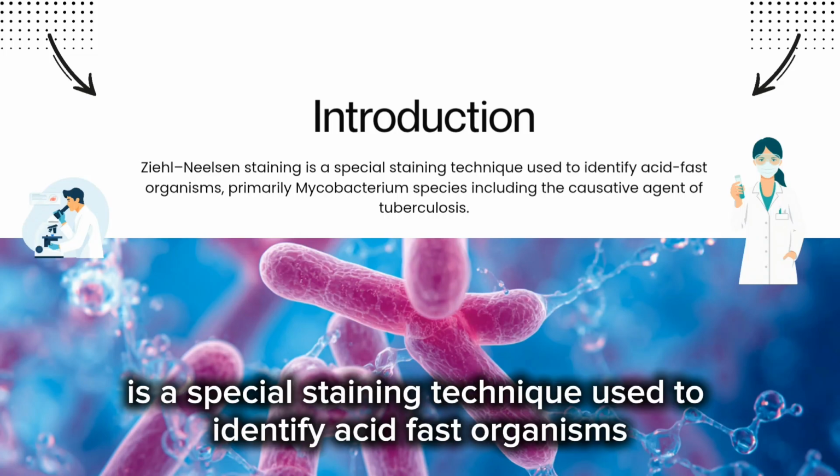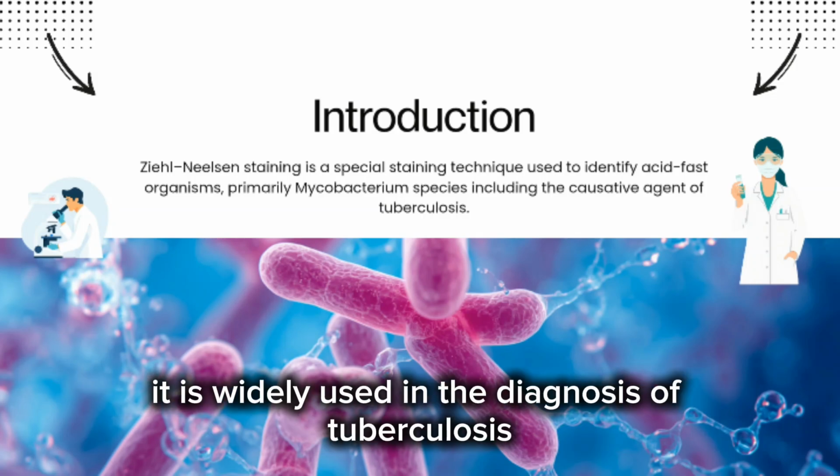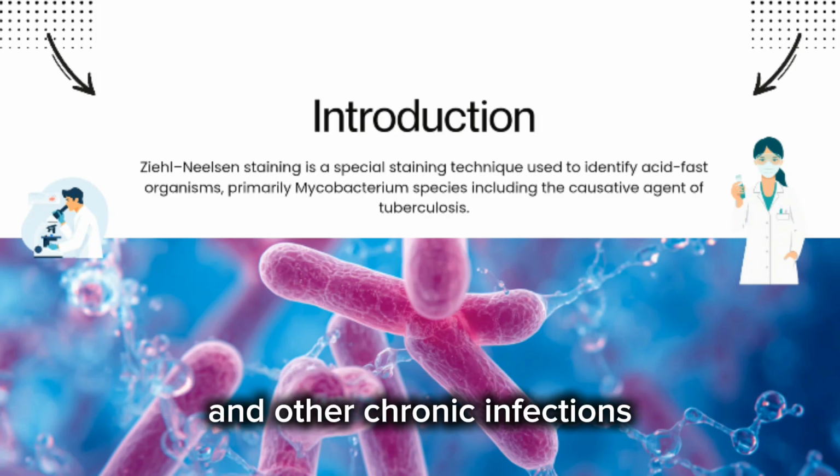Ziehl-Neelsen staining is a special staining technique used to identify acid-fast organisms, particularly mycobacterium species such as Mycobacterium tuberculosis. It is widely used in the diagnosis of tuberculosis and other chronic infections.